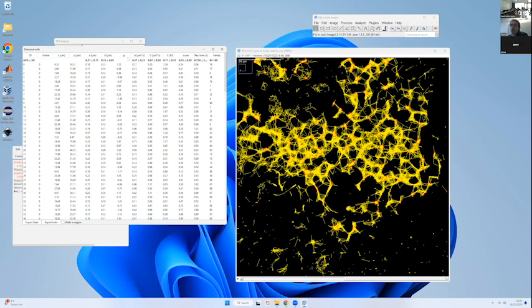Phi is the orientation of the boundary, so it's the angle of the ellipse. A and D are the attraction and diffusion coefficients of your wells. And A over D is the energy in kT. And the score is derived from the least square error in this. And also you have the residence time, as David mentioned.